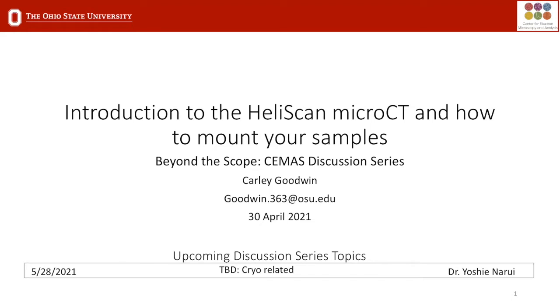This morning, Carly Goodwin will be talking about the HeliScan microCT system, and in particular, how to get your samples into the system so that you can get some good results.